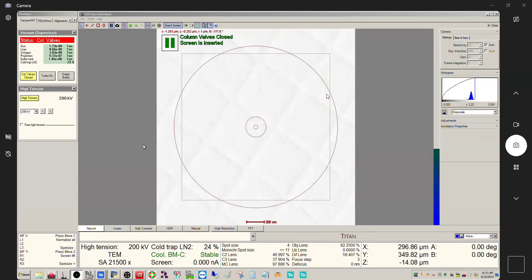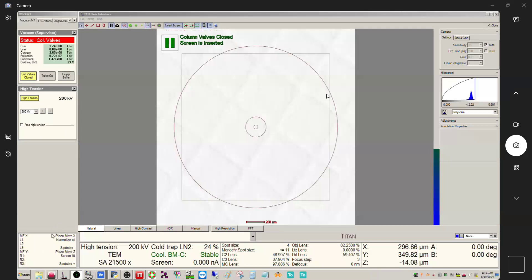Alright hello everybody. Before I continue with the alignment file videos, one thing I wanted to do really quick - and this is definitely going to be a very quick hitter video - is I want to show you where your alignment file lives, how you can find it and back it up, and we'll take a quick peek inside of it so you can see what's actually in it.